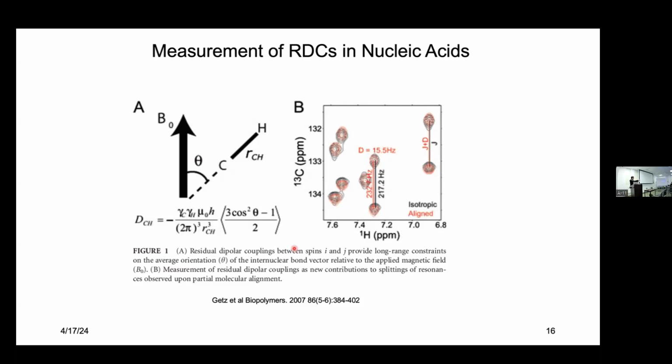Because you're adding to a negative number. So you've got to be careful, because to translate to the RDC, the contribution to the splitting can only be analyzed with the knowledge of the sign of the scalar coupling to begin with. In fact, dipole couplings are often used to determine the sign of the scalar, where it's not easily determinable from the gyromagnetic ratios.